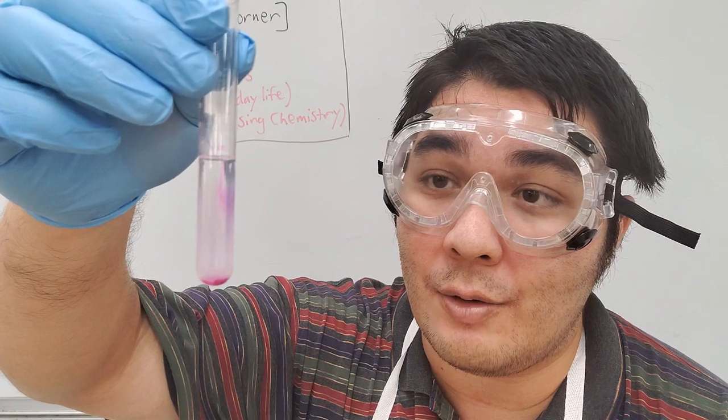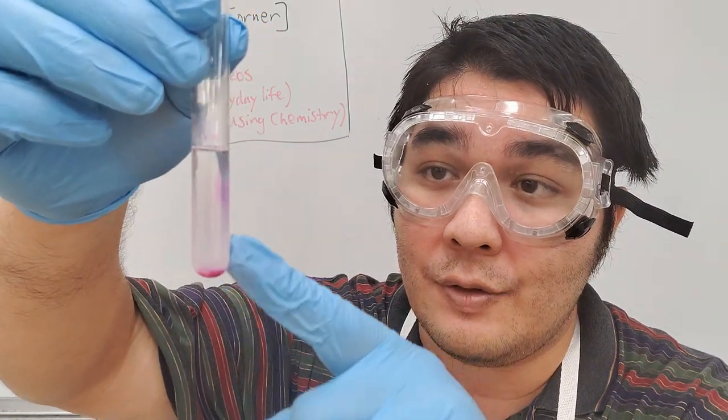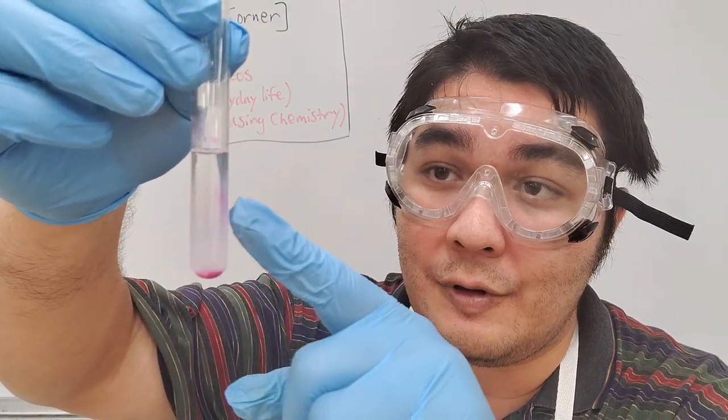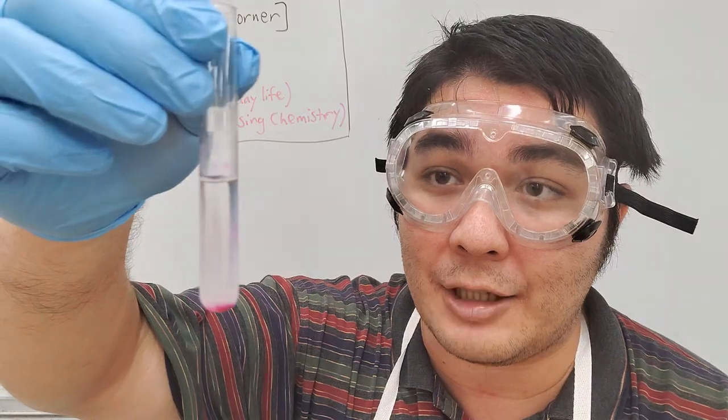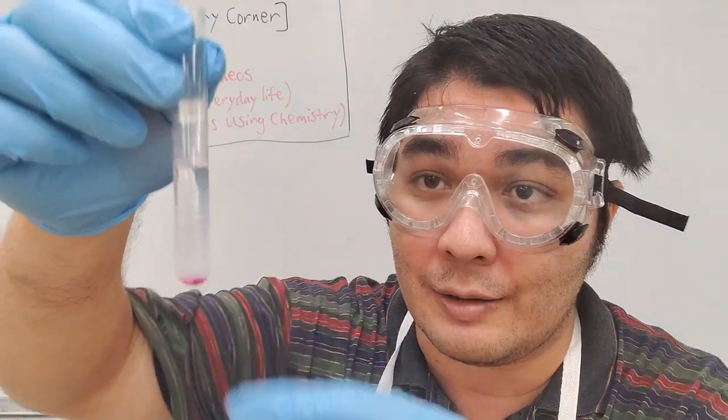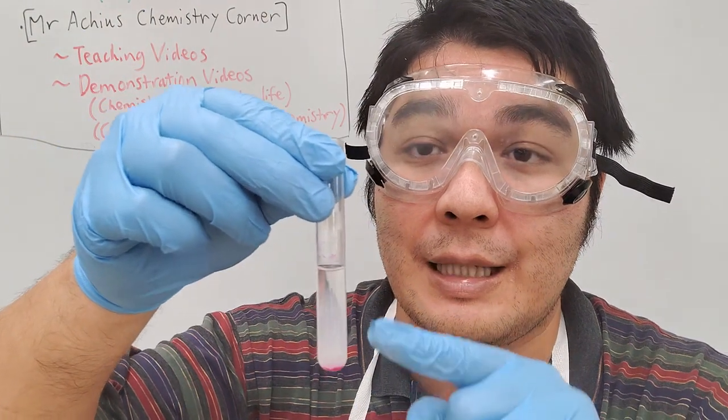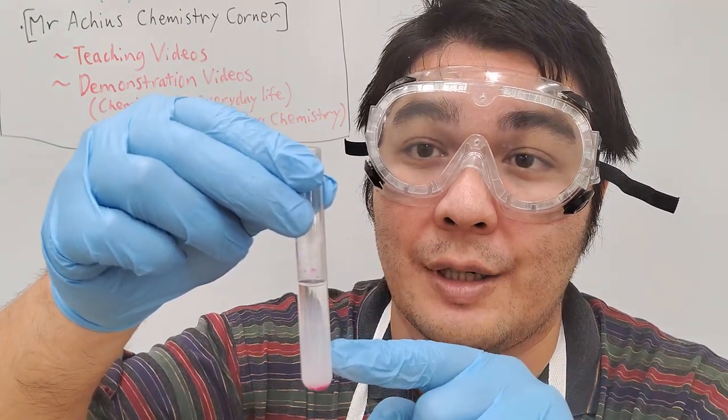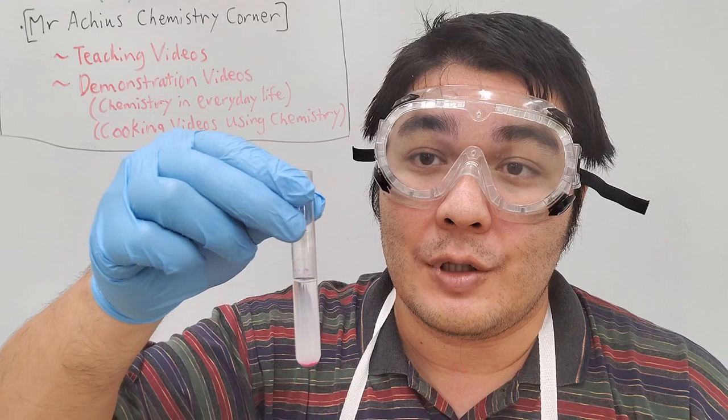Notice I did this a little bit slower because as you can see, the pink color didn't actually last all that long. Notice it's starting to turn maybe a little bit white over here.